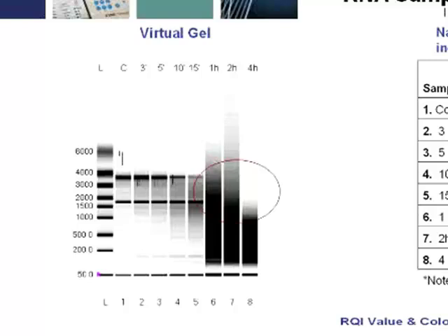Either poor purity or poor quality will lead to increasing and increasingly variable CT values. And that will pose a big problem in getting good biological reproducibility and hence good p-values in your studies. So it's important to test for these things with your RNA as a step in the process.